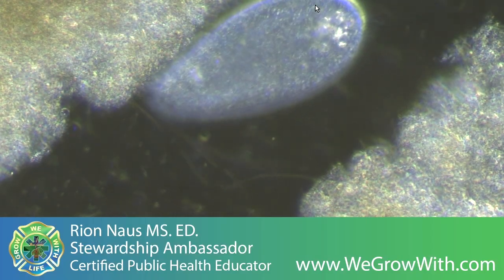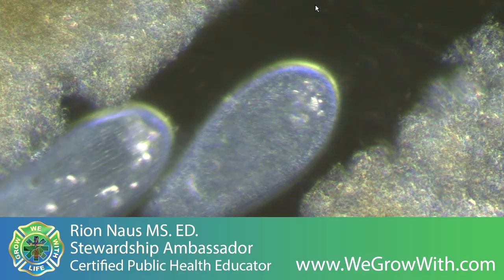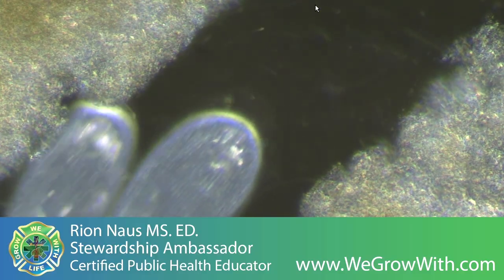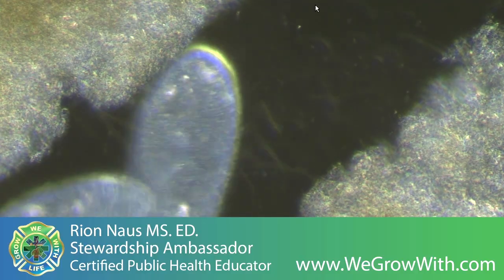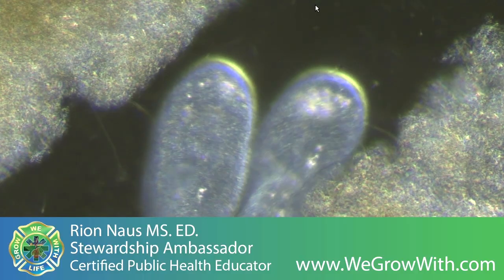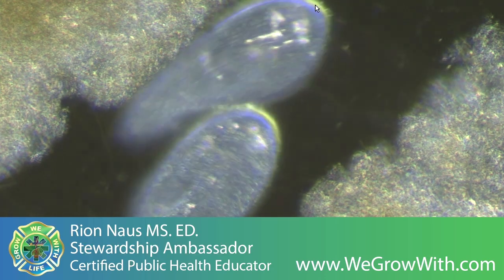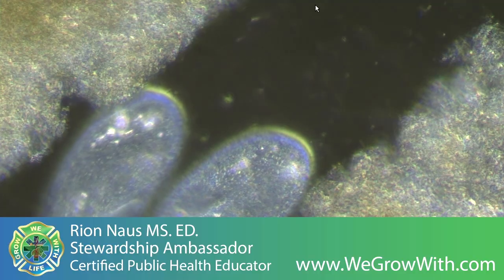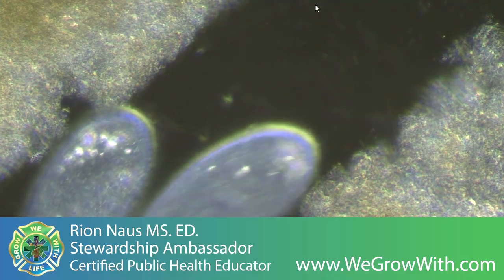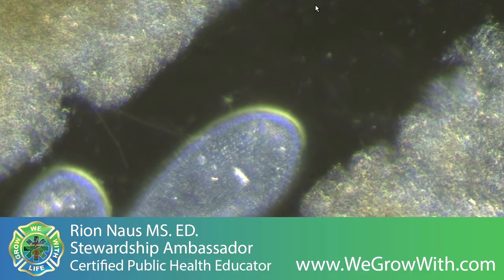You can see the speed at which those little hairs are churning around their whole bodies. So as that partial pressure increases, the different mineral components interact with different enzymes.